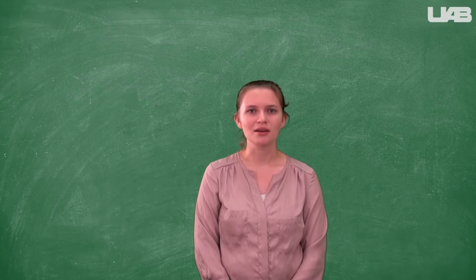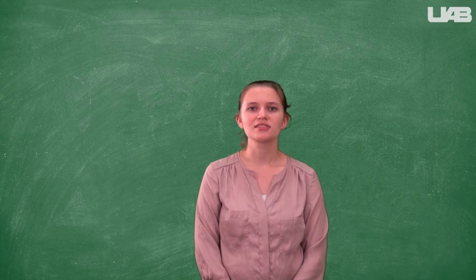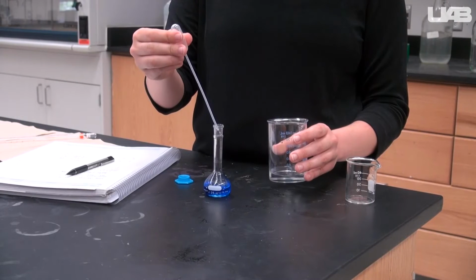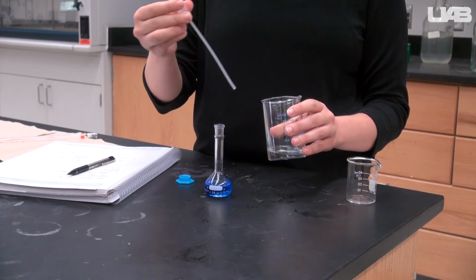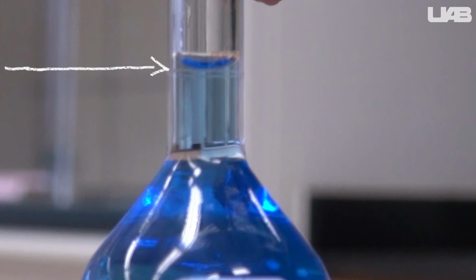After adding the ammonia, move back to your lab bench. You will be adding water to the flask until the meniscus touches the graduation mark. You must add the water slowly and watch to ensure that the copper hydroxide doesn't reform. If at any time the solution starts to become cloudy, return to the hood and add 5 more drops of ammonia before adding any more water. If you accidentally fill it past the meniscus, you will have to start over.